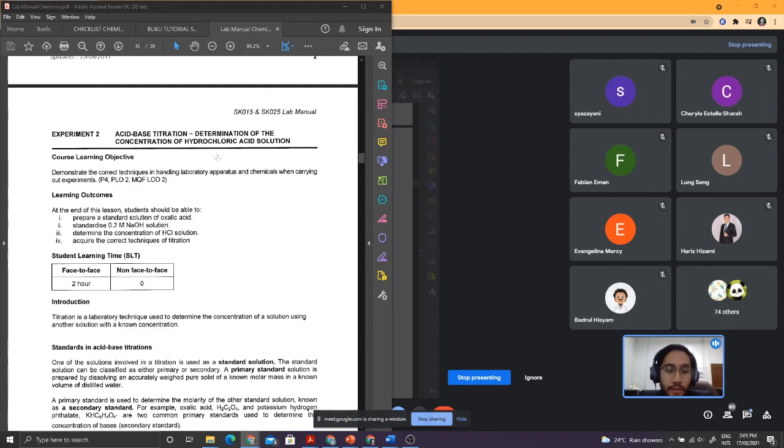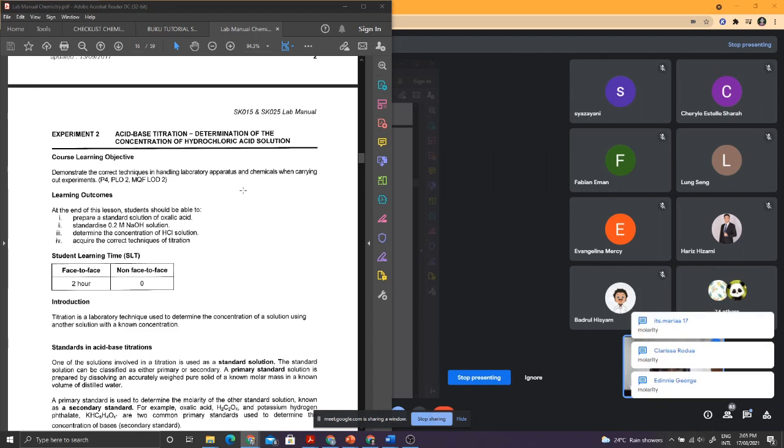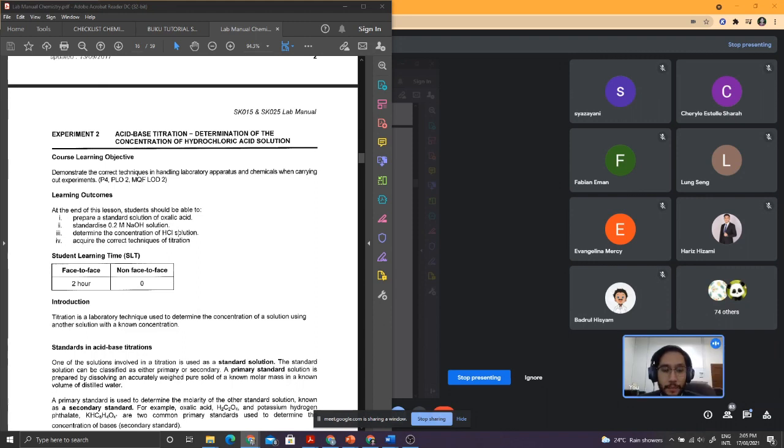And concentration is also known as, ingat tak? Itu kita belajar, it is, yes, molarity. Okay, good. So basically kita nak tahu molarity hydrochloric acid lah. Tapi kita cannot just know terus hydrochloric acid. We have step by step.